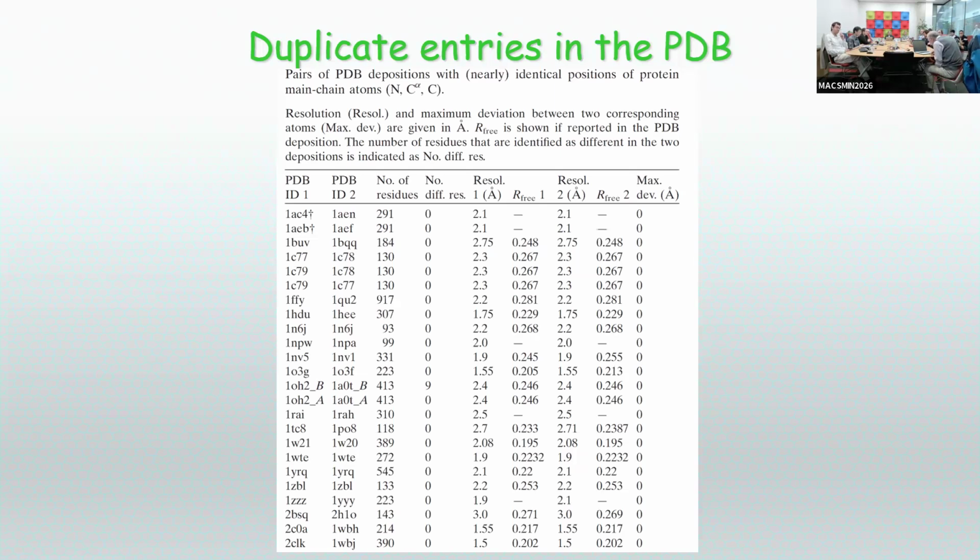And one of the things I want to show here are the structures. You can see on the bottom a duplicate where I was questioned, how come a duplicate is a duplicate of itself? What's the meaning of it? I was asked this question last week because I gave this talk to my colleagues at NCI, and they have very, very good eyes, much better than mine, and they pointed out that that doesn't make any sense. Yes, it doesn't make any sense, but it was not done by sensible people, because what that particular structure, there are two of those, have is a PDB file in which the same molecule is in the same place twice, superimposed on itself, which would not be a crime if it weren't for the fact that it's at full occupancy. So in other words, the structure has an occupancy of 2.